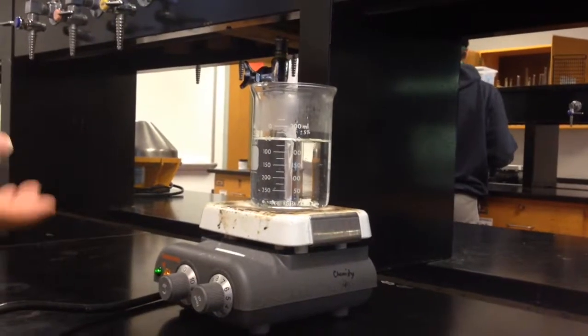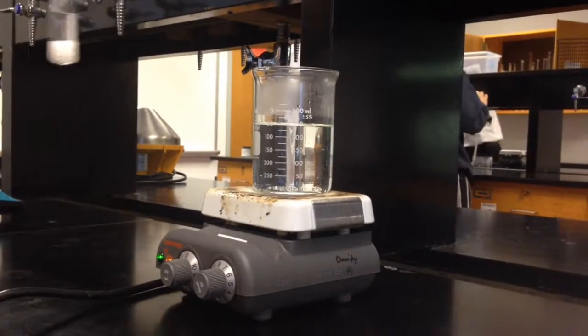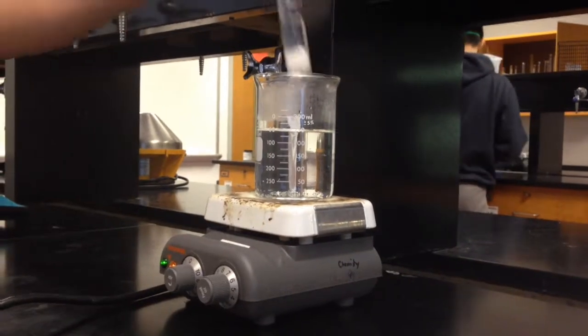This is what your hot bath setup should look like. You're going to put your KNO3 solution into this hot bath so it can dissolve. This process can take some time, so while you're waiting, here's some footage of Darren slipping on a banana peel.